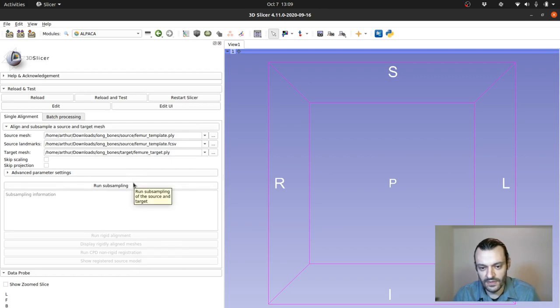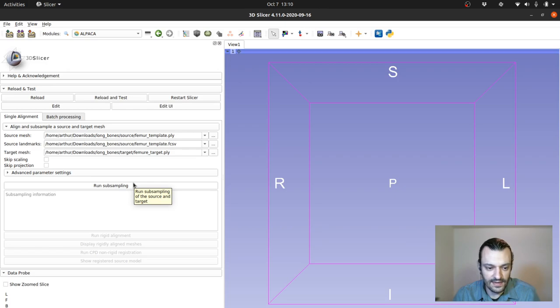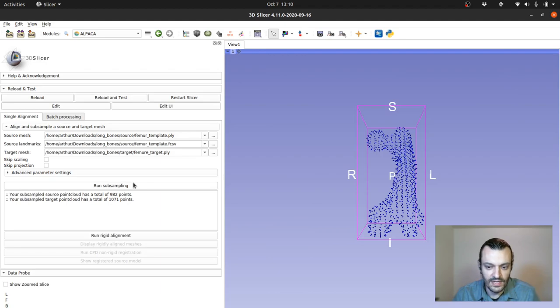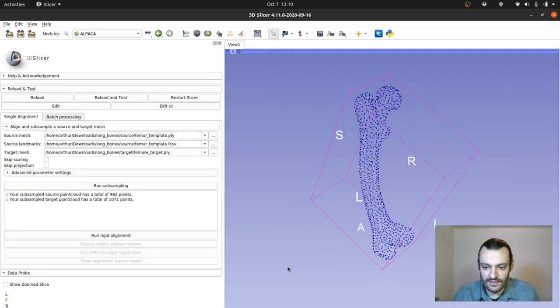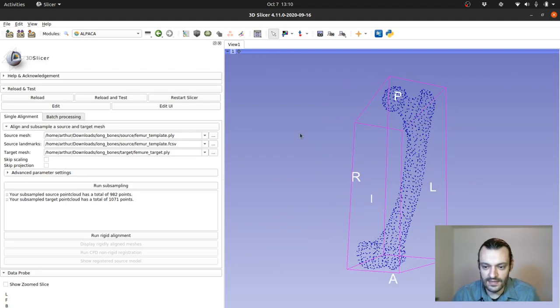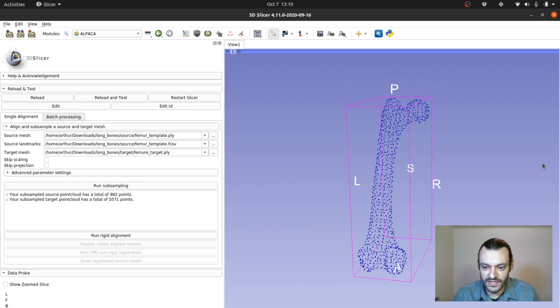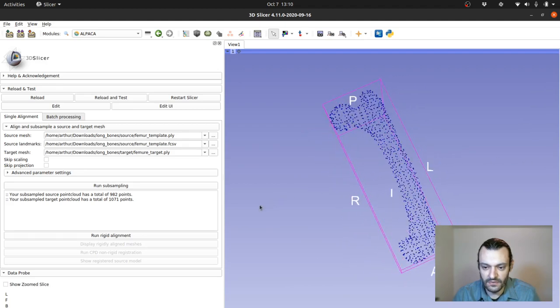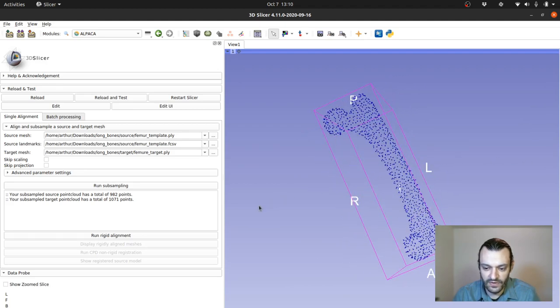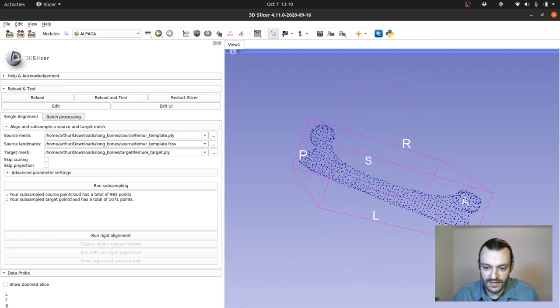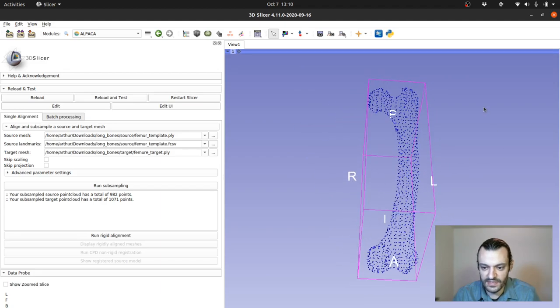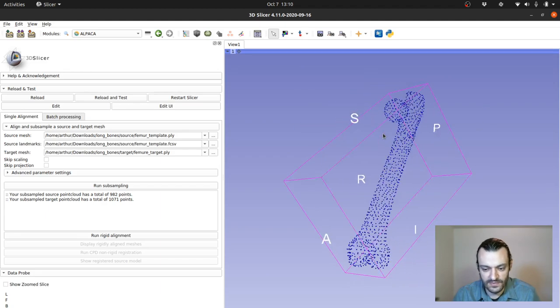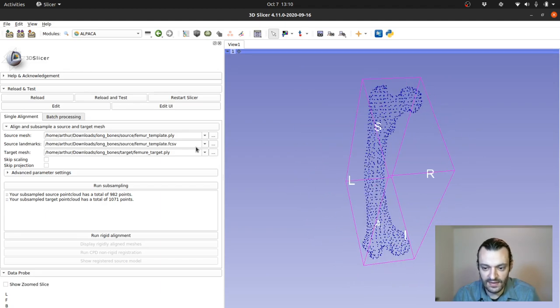The first thing that we want to do, as I mentioned in the slides, is that we want to subsample those meshes so that we're working with a much sparser representation of morphology. So we can click on that and essentially what we get is the target mesh here, the male gorilla femur, but a much sparser representation of it, essentially a point cloud.